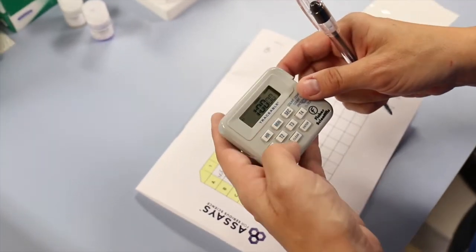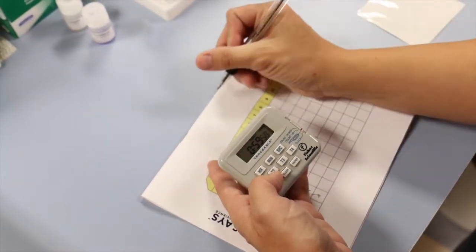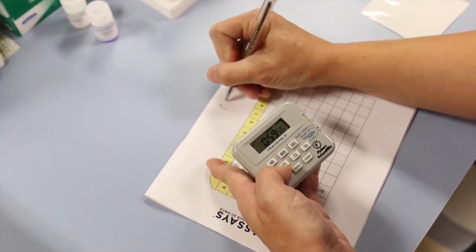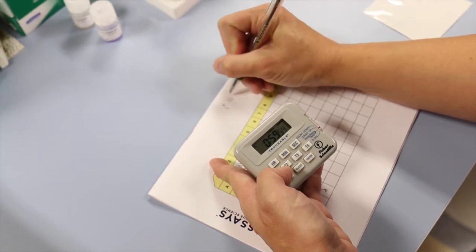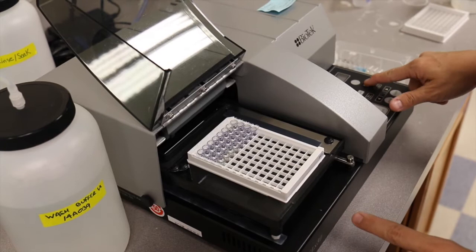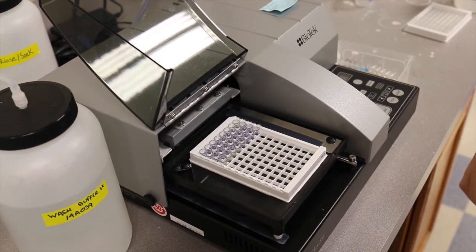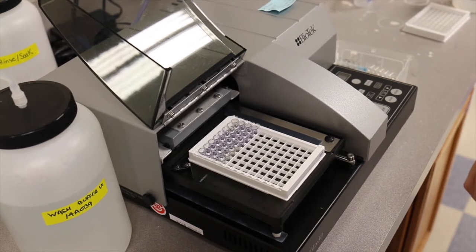Note the time and temperature that the reaction was initiated and set a timer for the incubation time specified in the kit protocol. At the end of the incubation time, wash the plate the specified number of times with the wash buffer provided.